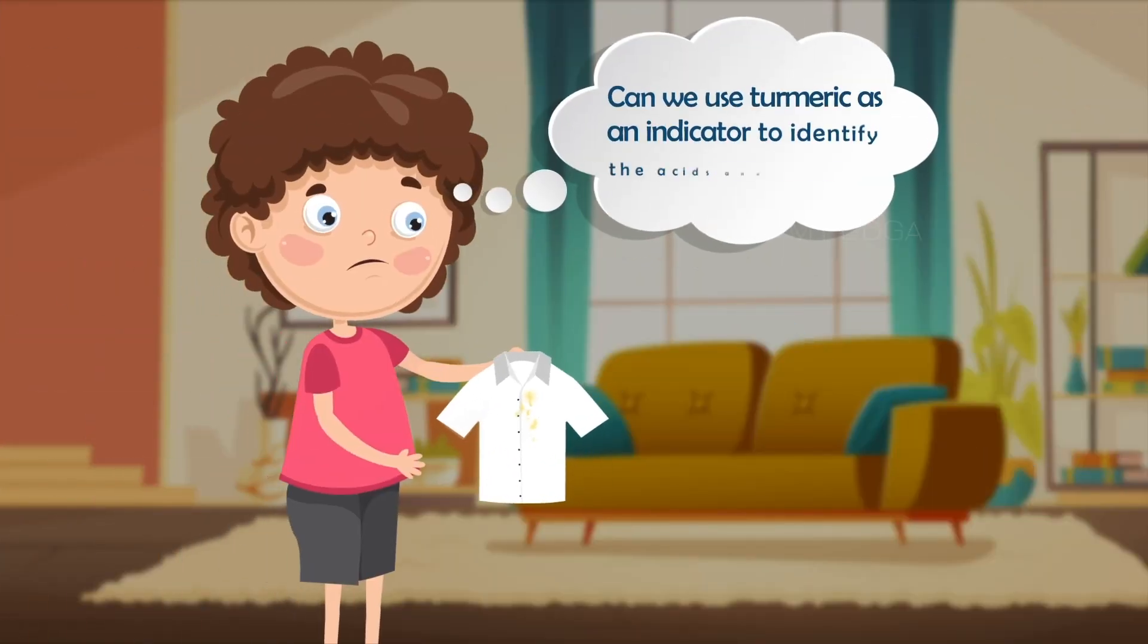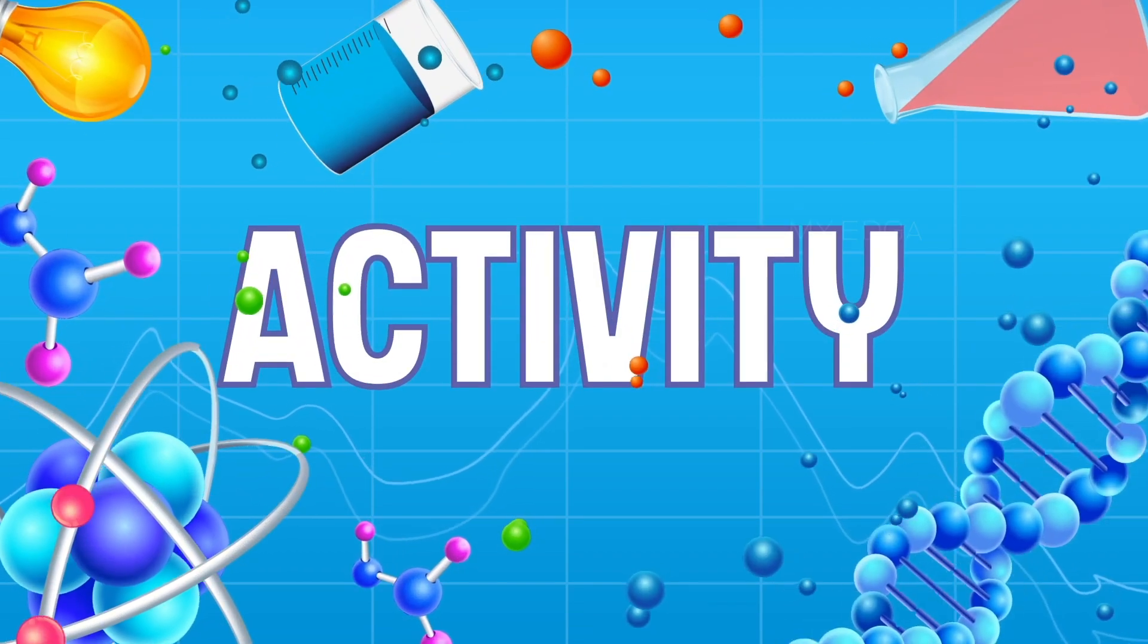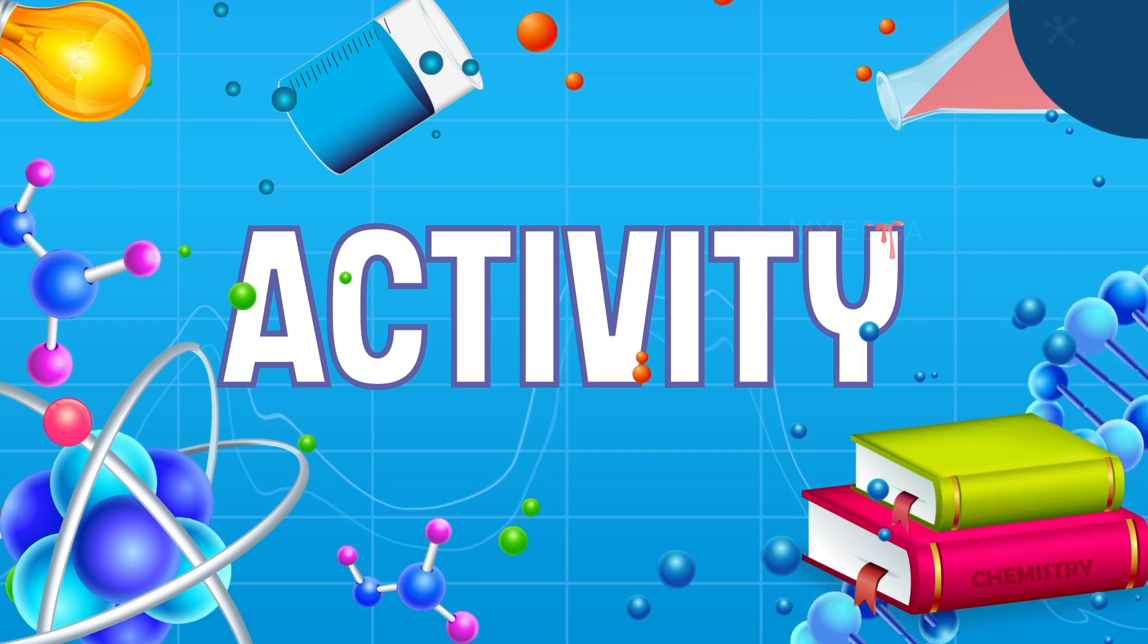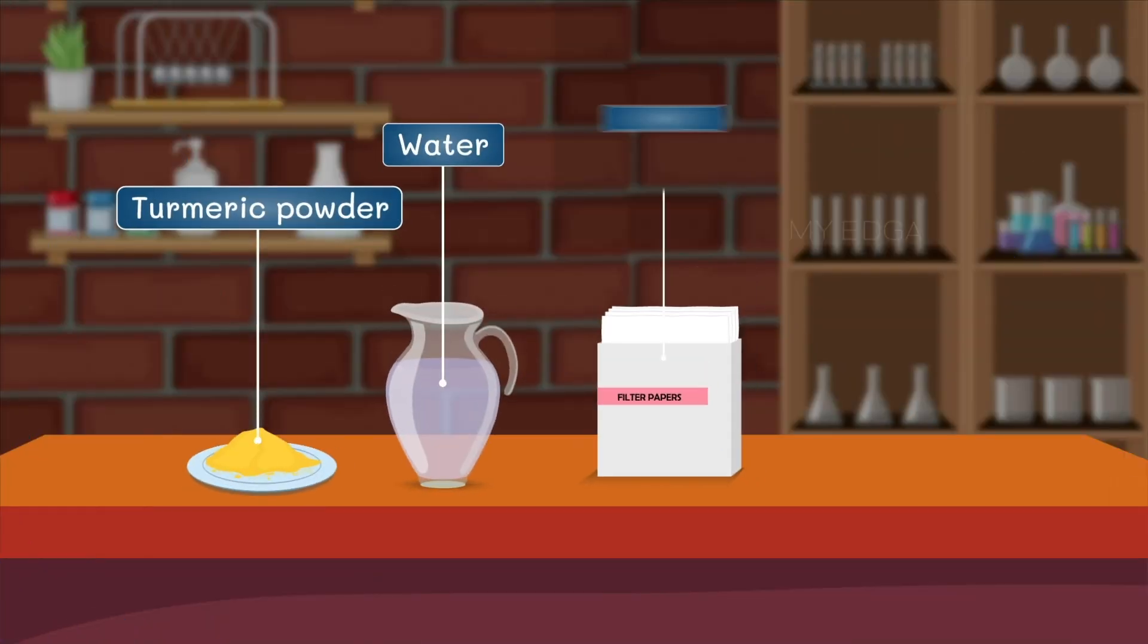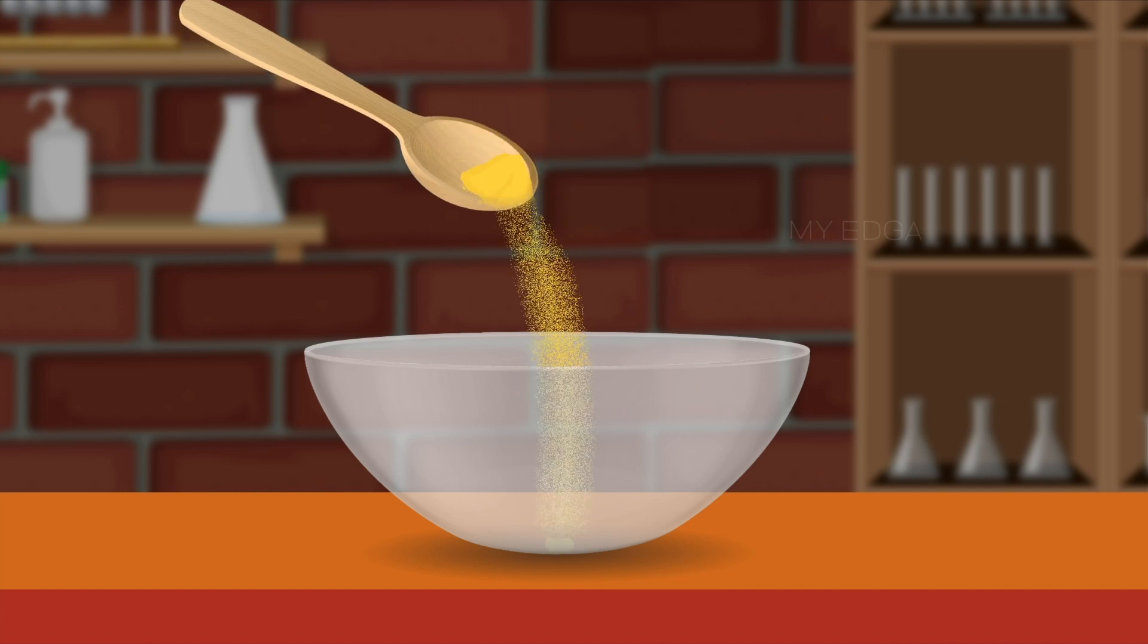So can we use turmeric as an indicator to identify the acids and bases? Come, let us discuss the indicator action of turmeric through an activity. We need turmeric powder, water, filter paper, and soap solution. Take a tablespoon of turmeric powder, add a little water and make a paste.